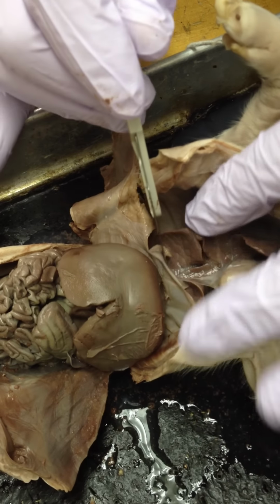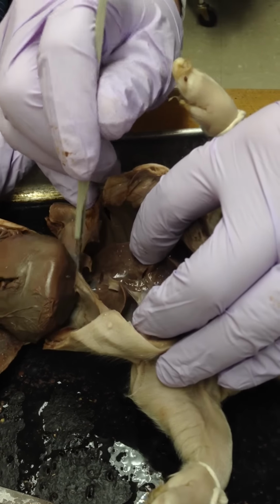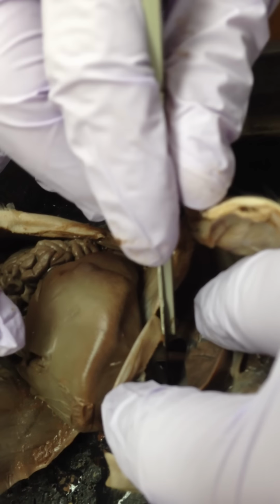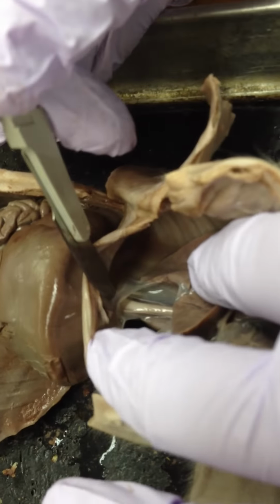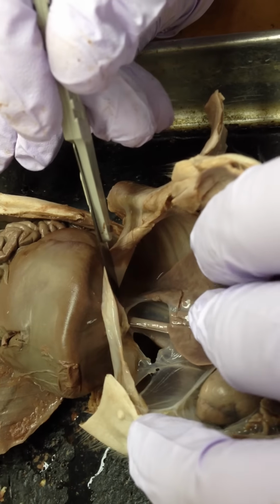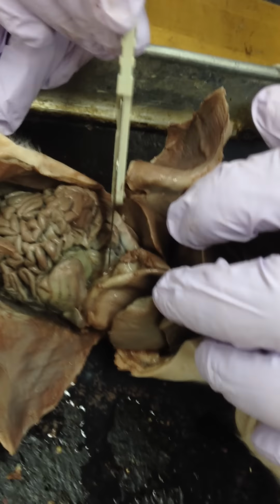I was wondering if we can see where the esophagus and stomach join together. There should be a little hole in the diaphragm. Okay, yeah, there it is, where it goes through. There's the esophagus. I think that'd be really cool to show also. The esophagus connects with the stomach underneath, and the liver is just covering the stomach always. On the left side, usually, is the stomach there.